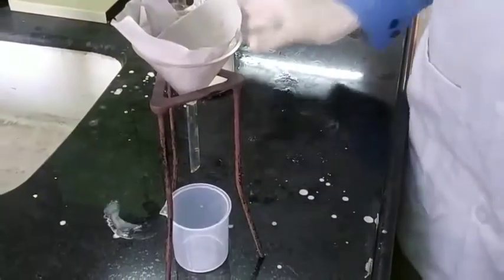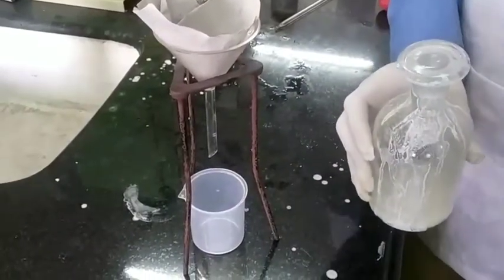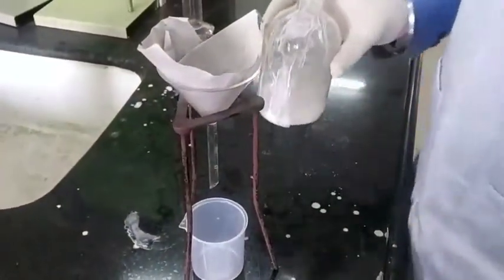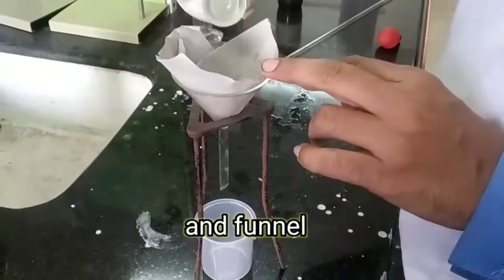Now we have to remove the talc which we have put in this preparation. For that we have to filter it. First of all, we will filter our preparation through this setup. This is filter paper and tripod stand.